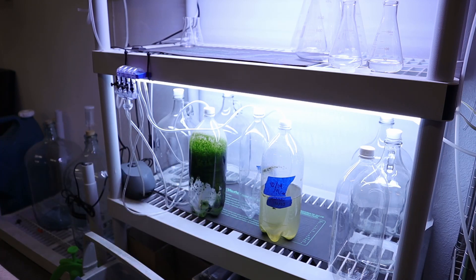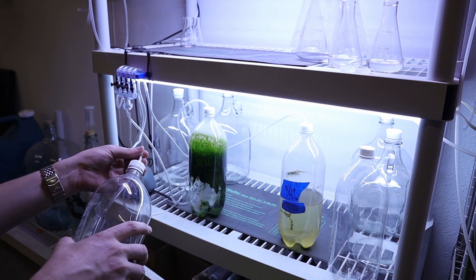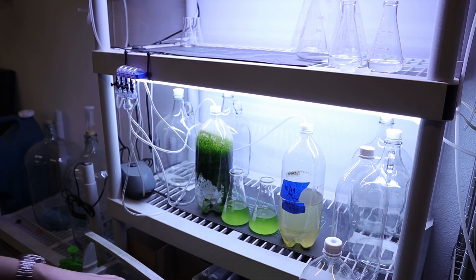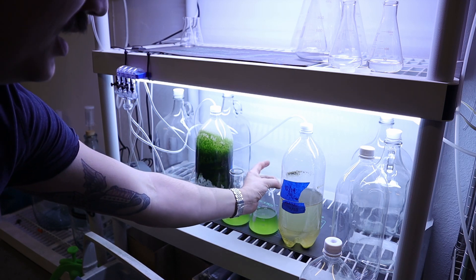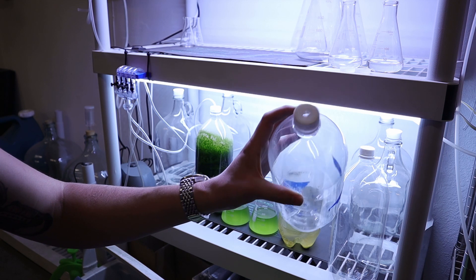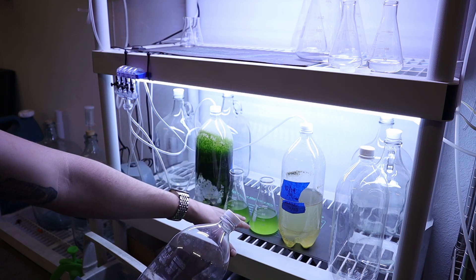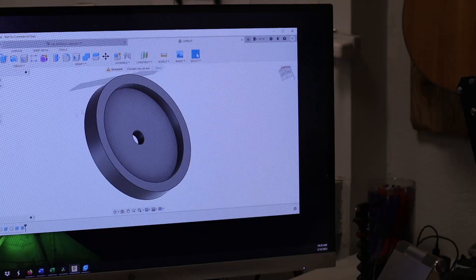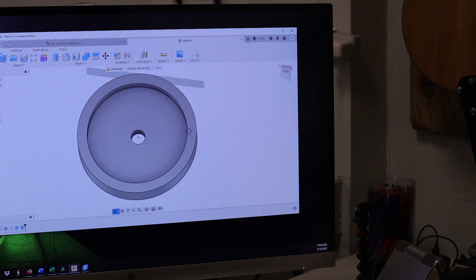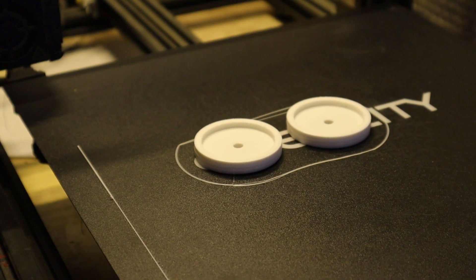This is where it's going to be set up. Let's get them in here and get this garbage moved out. They look so good right there. I'm going to 3D print some caps that fit perfectly on here and have a hole in the lid — similar to these two-liters — so I can thread the needle down on the air hoses for constant stimulation and percolation. We got the cap designed in Fusion, going to print two of these real quick and stick them on the flasks.